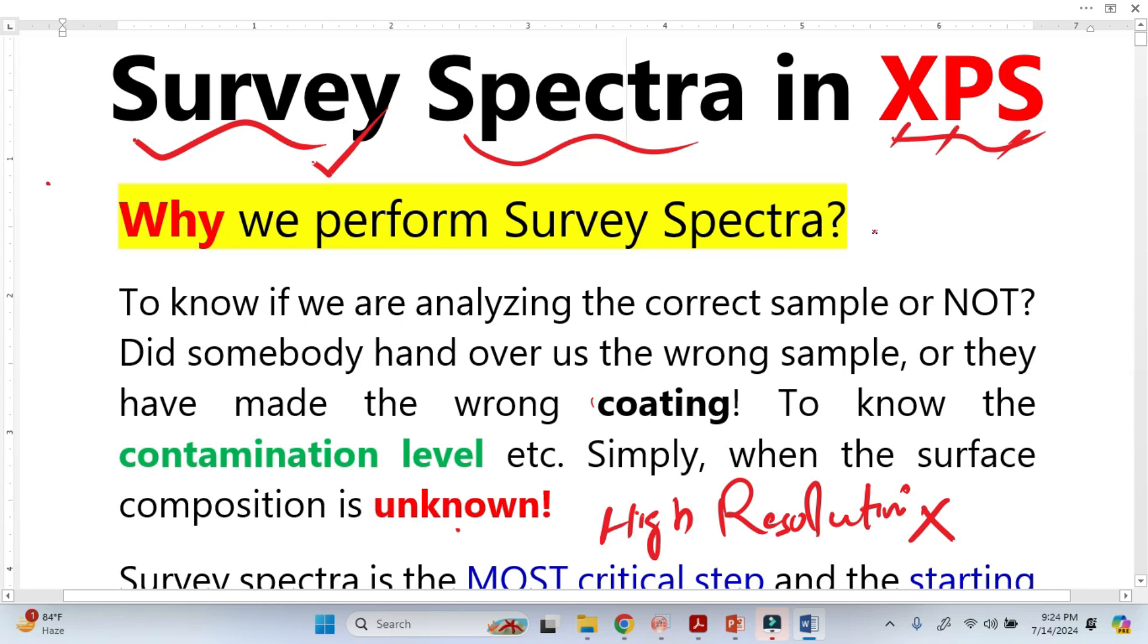Survey spectra is particularly important when we do not know the elements in the sample. For example, the element may be lead, may be cobalt, maybe oxygen, maybe zinc, but we do not know the elements, so we have to run the survey spectra. We do not know whether the sample is correct or not, if somebody handed over to us the sample, and we do not know about the coating process.